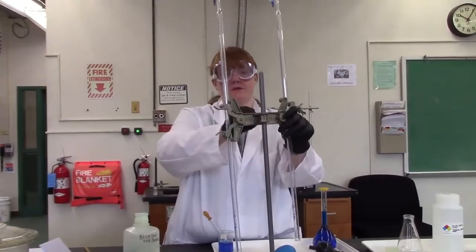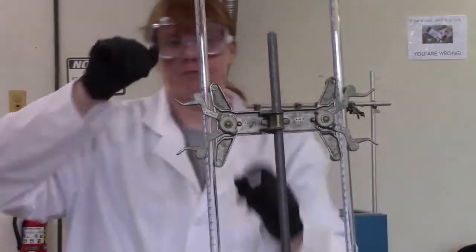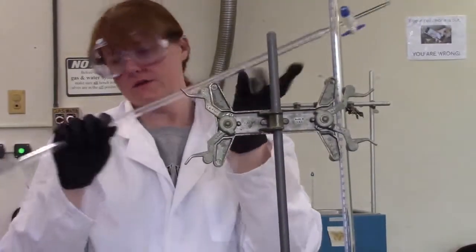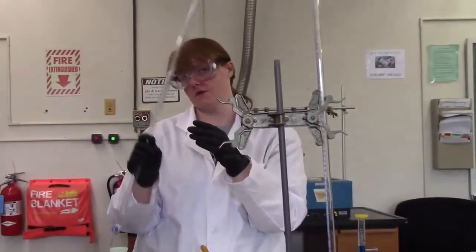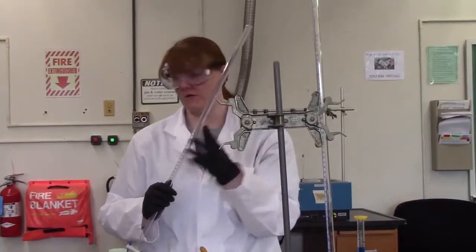This is called a burette clamp. They're specially designed to hold a burette completely vertical. You operate them by pinching the clamp here to let the burette go. Now burettes aren't super cheap so make sure you're gentle with this. Don't use it for sword fighting or whacking the table. I know it's tempting. Try to avoid it.